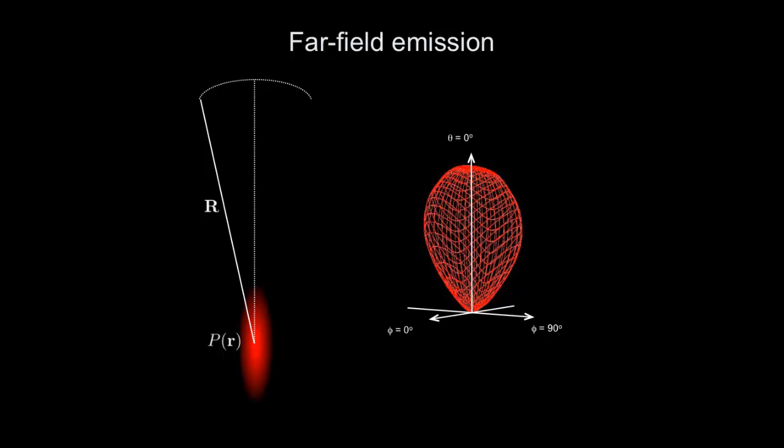That's what it means. So this coherent emission is very different from fluorescence. In fluorescence, it's almost isotropic. Wherever you put your detector, you see something. If you put it at 90 degrees, in fact, you still see something. In this coherent microscopy, you do not. Okay? The emission is very well defined because it constructively interferes predominantly in this direction and not away from it.